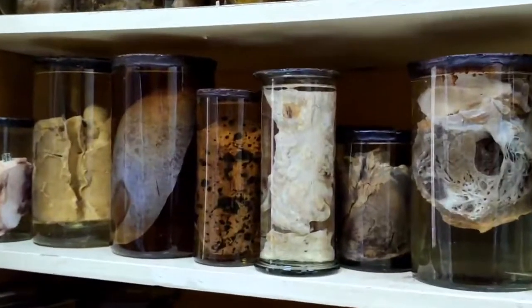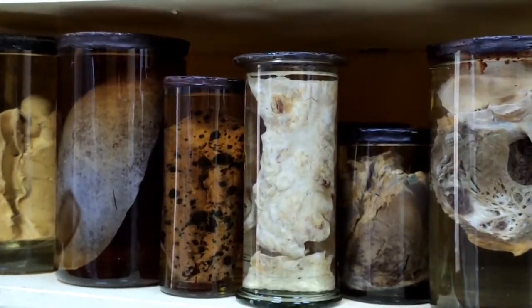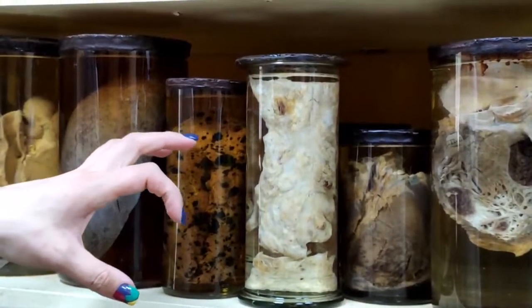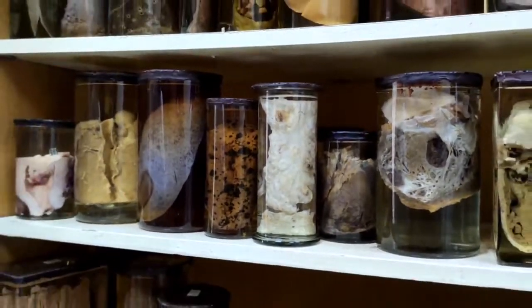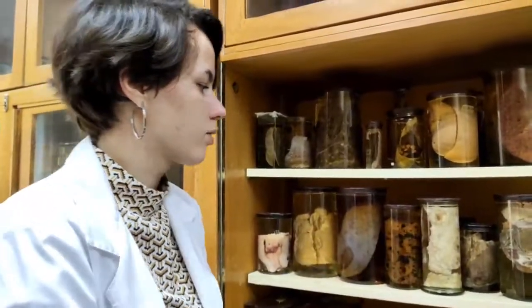The next one is atheromatous plaque. The next one is atheromatous ulcer, and the last one atherocalcinosis. So you should tell me all these steps of developing of atherosclerotic plaque.